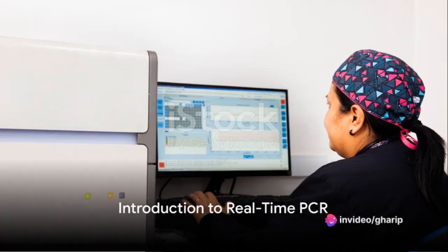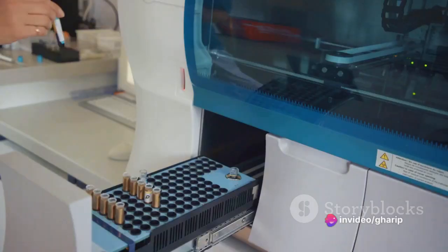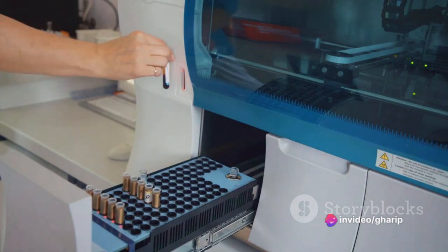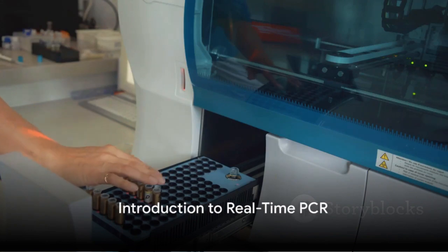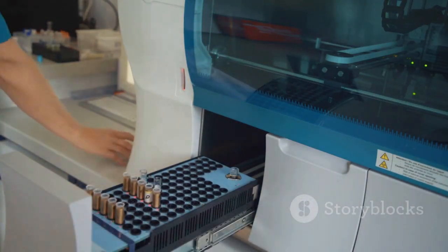Imagine a world where we can detect and measure the presence of specific DNA sequences and monitor them as they multiply in real-time. Welcome to the fascinating world of real-time PCR or quantitative PCR.